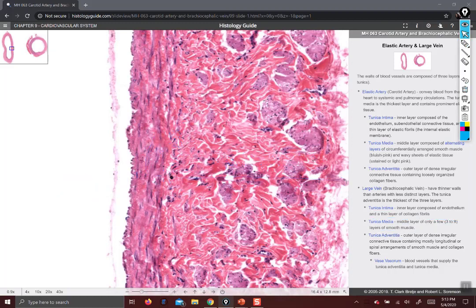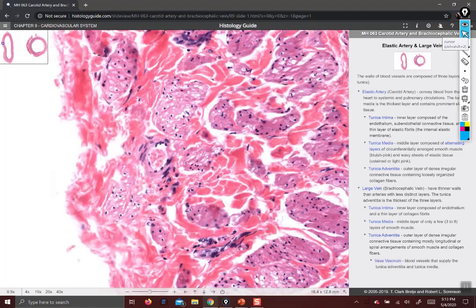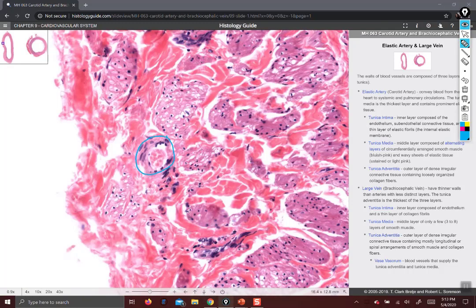The final thing I'll show you is the vasa vasorum. Vasa vasorum are blood vessels that supply the outer and middle layers of the vessels themselves. Large vessels need their own blood supply, and that comes in the form of the vasa vasorum. There's one right there. When you're looking for vasa vasorum, you want to look in the tunica adventitia.